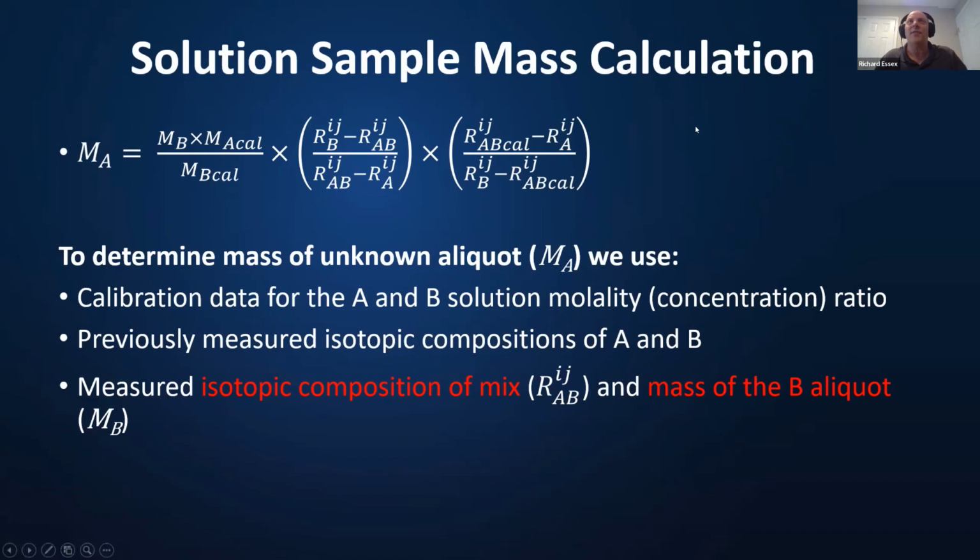For instance, half a gram of your unknown material or your sample, for lack of a better term, and then 50 grams of your spike. Mix those together to get a ratio that you can measure easily on a mass spectrometer, and then essentially you can calibrate this, I guess, molar ratios.